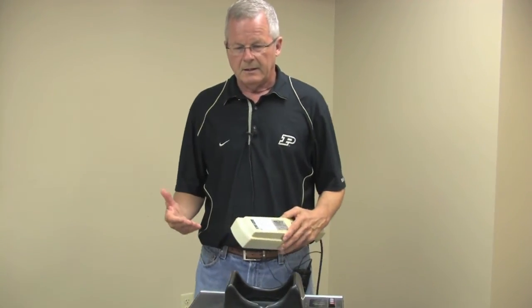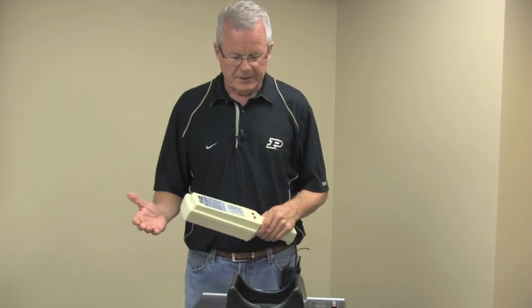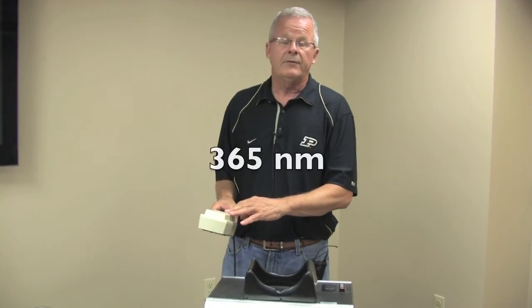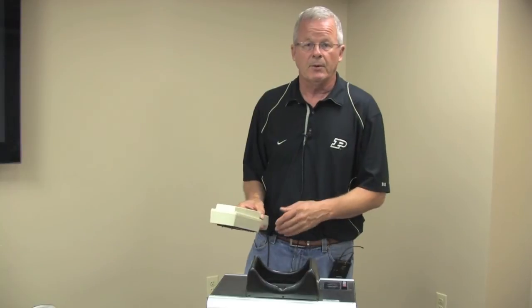One of the most important things you need for the test is an ultraviolet light source, and there are a number of types that you can get. There's the wand type here that has an ultraviolet lamp. It's long wave — about 365 nanometers is the proper wavelength.